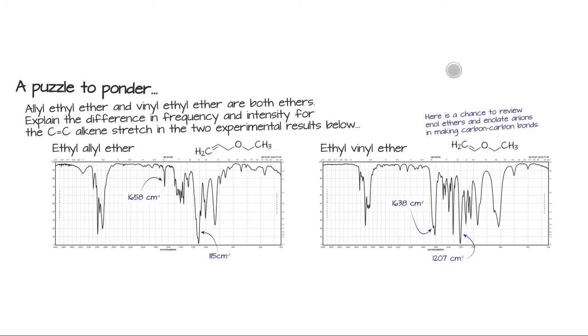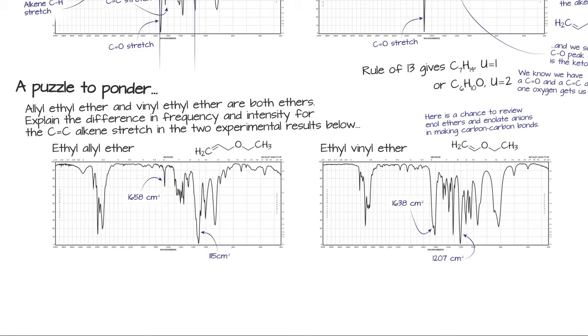Here we have an enol ether. Think about the nature of enol ethers compared to this, and as you think about why this double bond is so nucleophilic because of this oxygen, think about the nature of that single bond. Is it really all single? Think about the nature of that double bond. Is it really all the way to double when we imagine the electronic structure of an enol ether compared to a regular alkene? So again, review your organic chemistry and the reactivity of systems, and that could explain this for you. So I invite you to talk about that with your friends. Ask me if you can't come up with an answer.